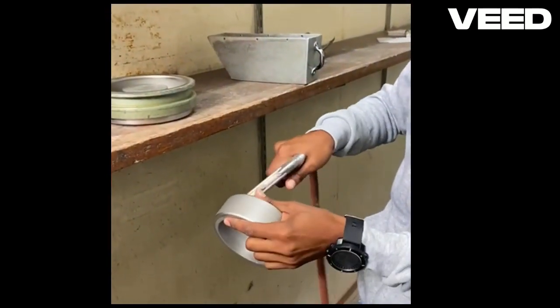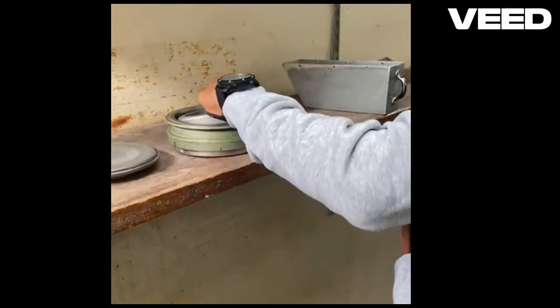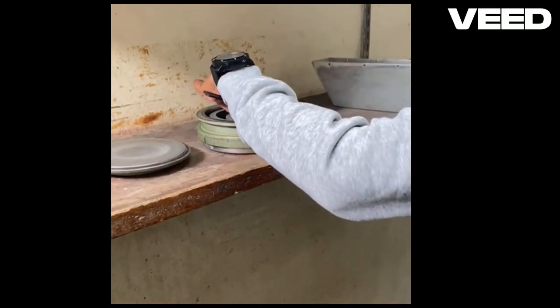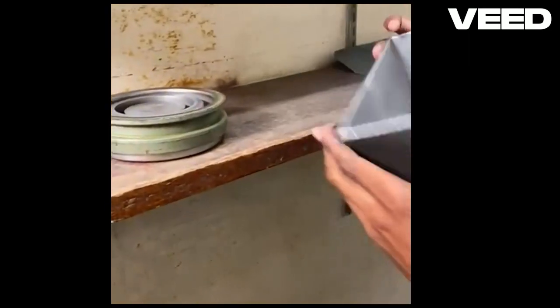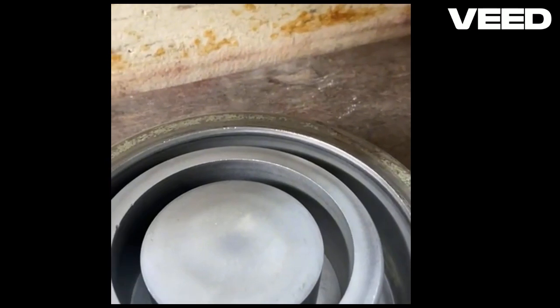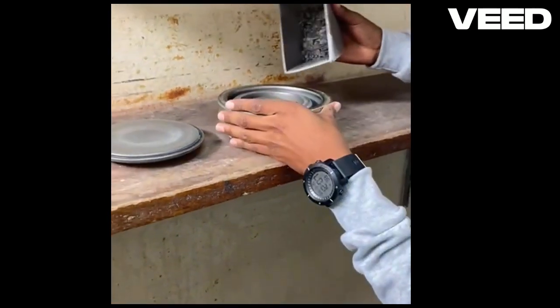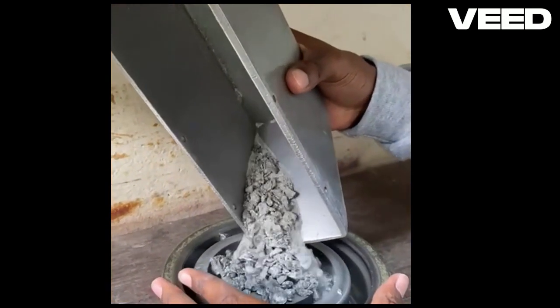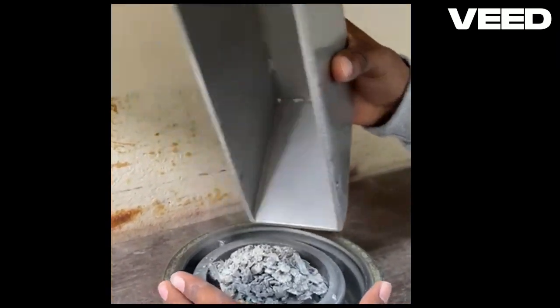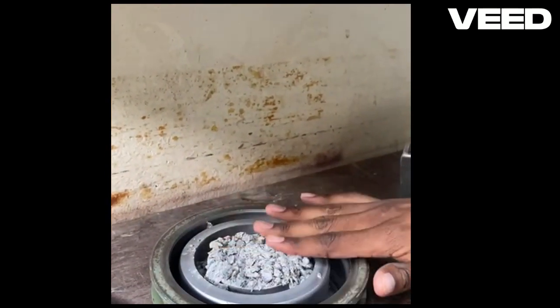A ring and puck mill consists of a stationary grinding ring, or bowl, and a rotating puck, or roller, positioned inside the ring. The ring and puck are typically made of hardened steel or tungsten carbide to withstand the high-stress conditions of comminution. The solid material to be pulverized is loaded into the grinding ring, usually in the form of coarse particles or small chunks. The sample may be a geological sample, or material sample that requires size reduction for analysis or further processing.